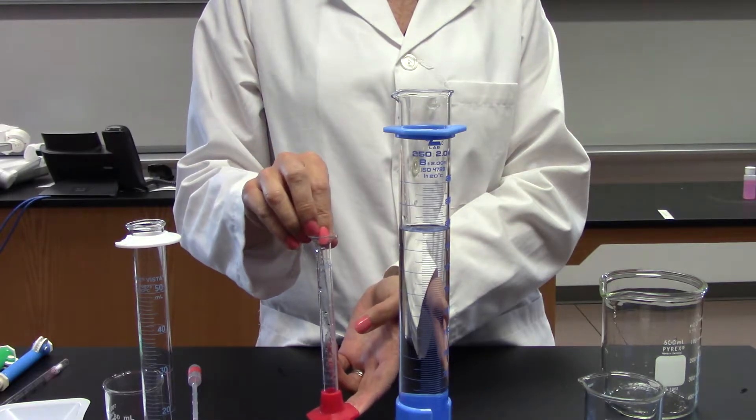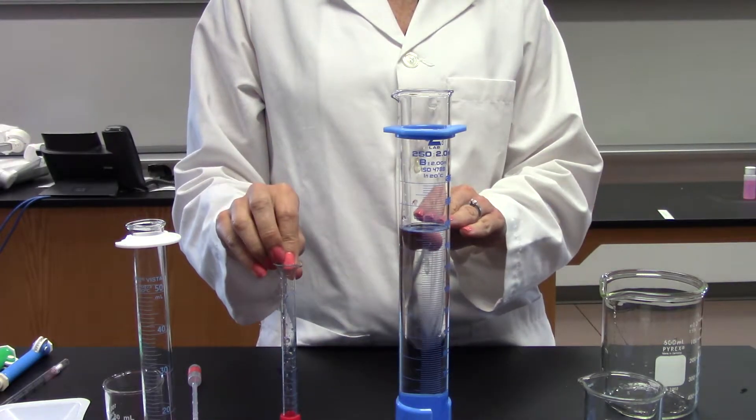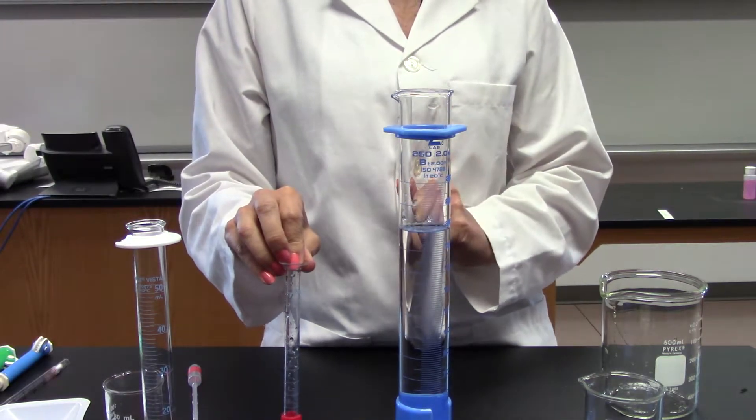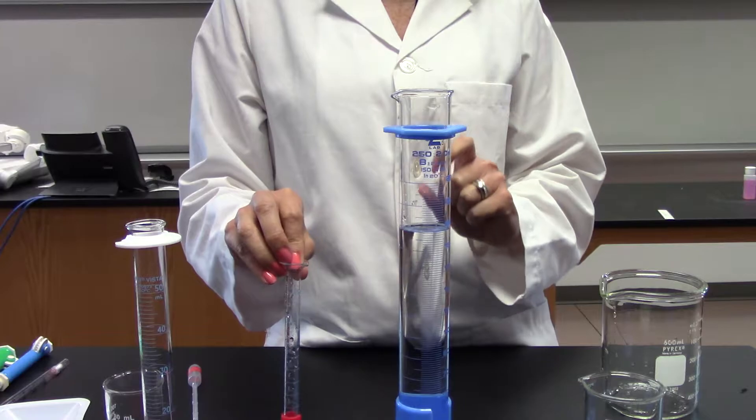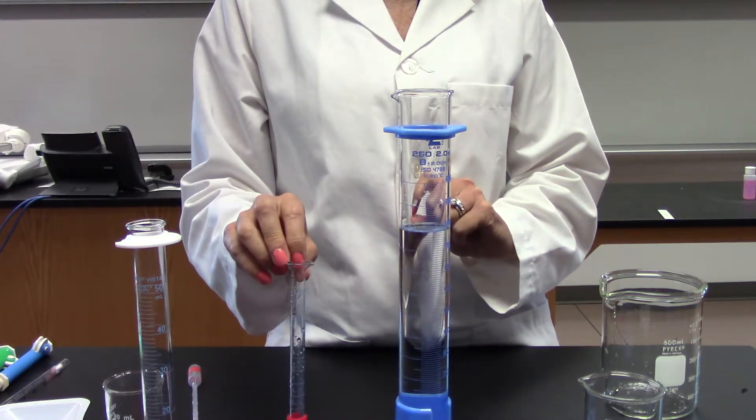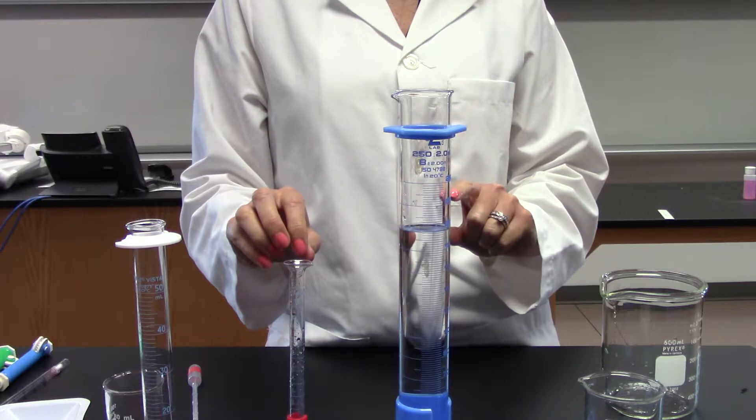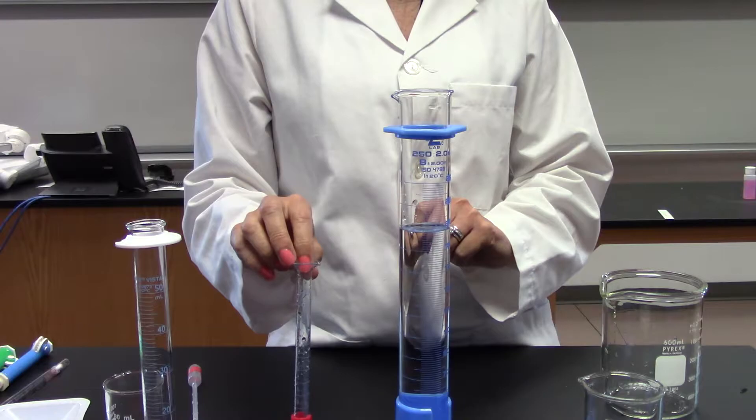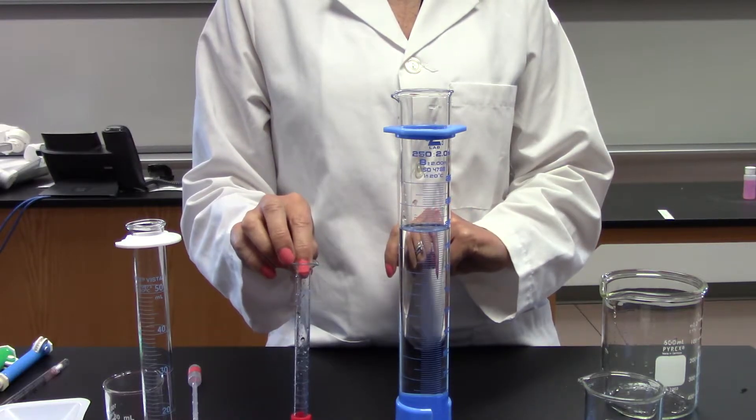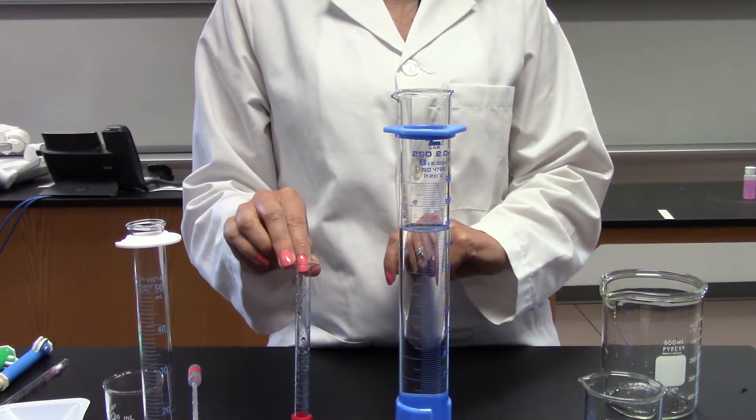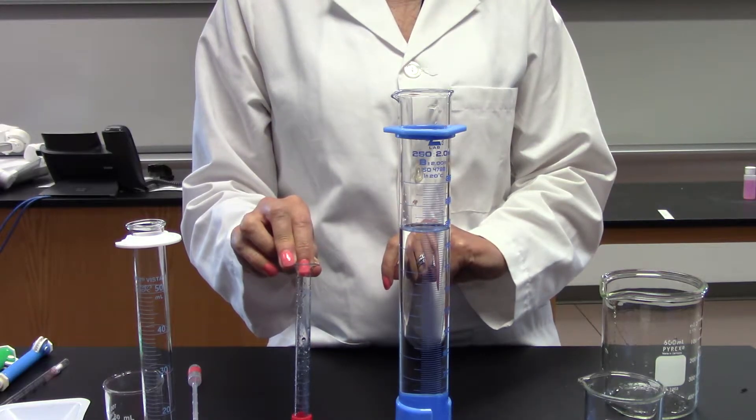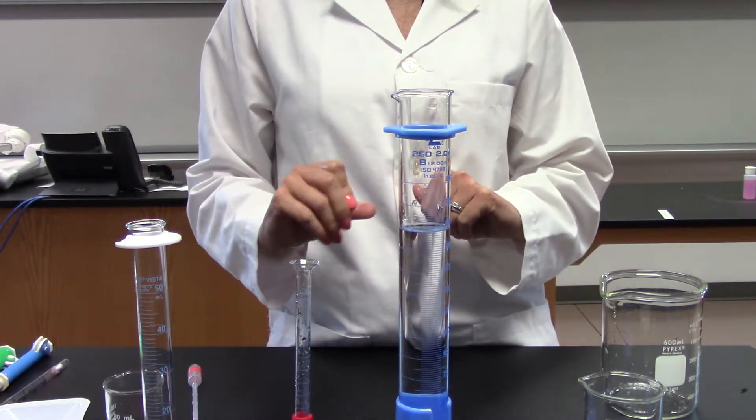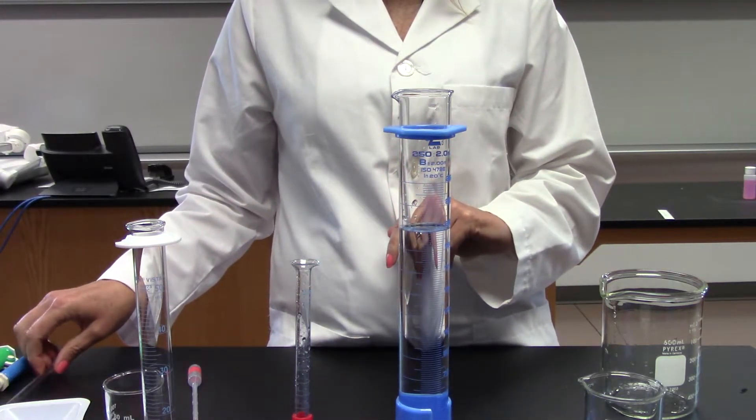So let's talk about what the meniscus is. When the liquid, in this case water, touches the glass, the surface tension between that glass and the water causes a curve in the surface of the water. In the case of water, it's what we call a concave meniscus. We measure the liquid volume from the bottom of the meniscus, meaning the bottom of that curve.